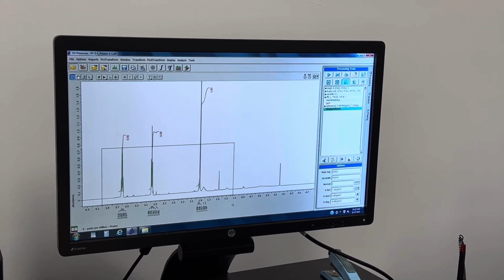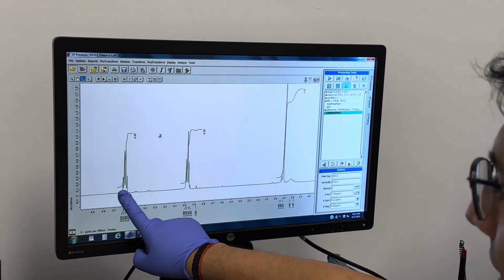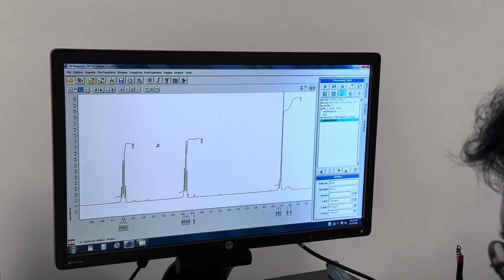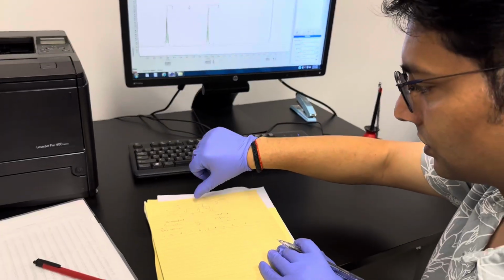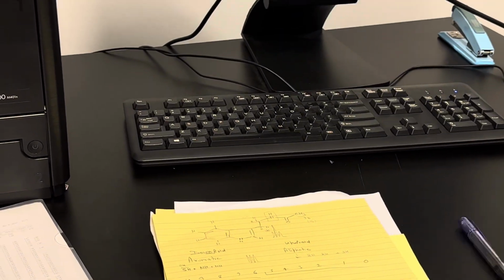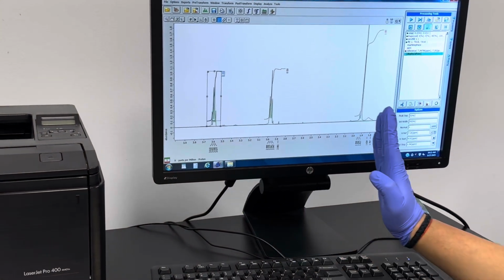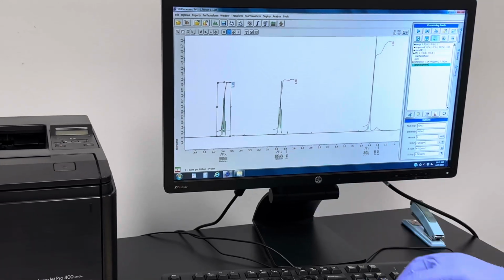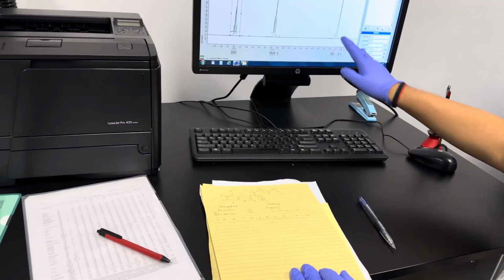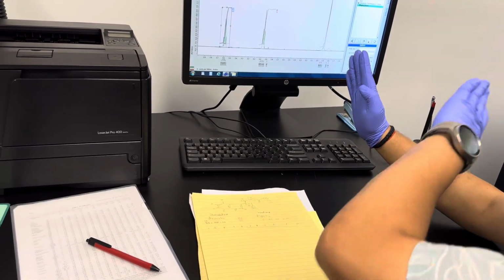Now this is something important we have to understand. Quartet, 4 peaks, triplet, 3, and singlet. So basically this is your singlet, quartet, triplet. Okay, so that means this part is done. But this number is important, so we have to give the number. If you integrate this peak, this value should come 2. So any of the hydrogens you should know. Since we know this 2, 2, 3 has to come, so I will give this 2. Once you give one number, the rest automatically it will take.